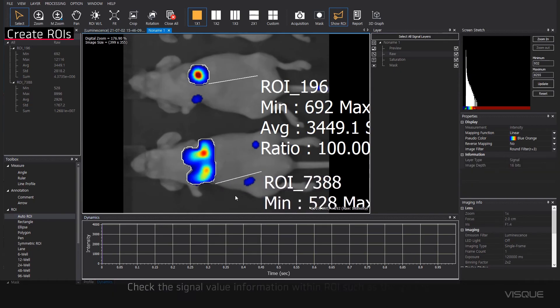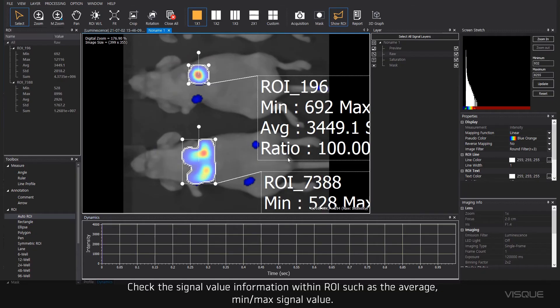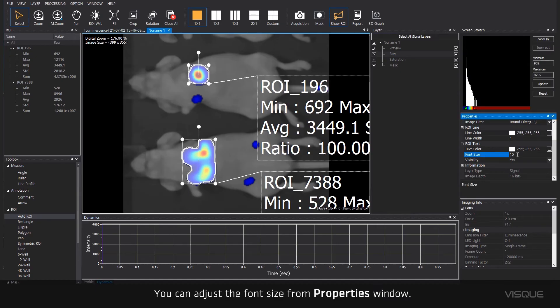Check the signal value information with an ROI such as the average, minimum, or maximum signal value. You can adjust the font size from the properties window.